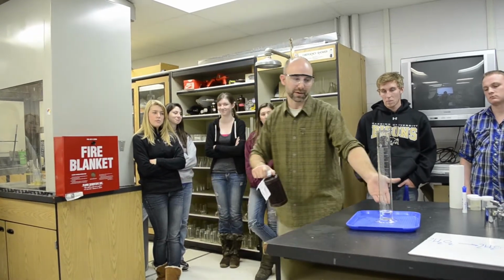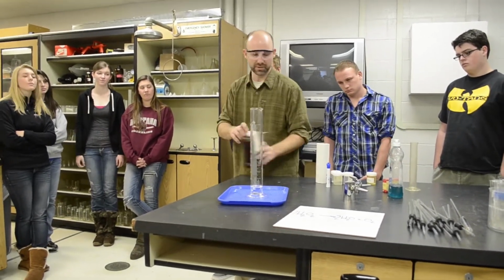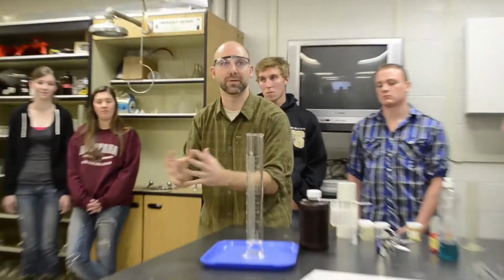You can see the reaction rate right now is what? So are the hydrogen peroxide molecules colliding with each other in there? Yeah, you betcha. They're just doing this, and they're just not getting over it. They don't have enough energy, right?